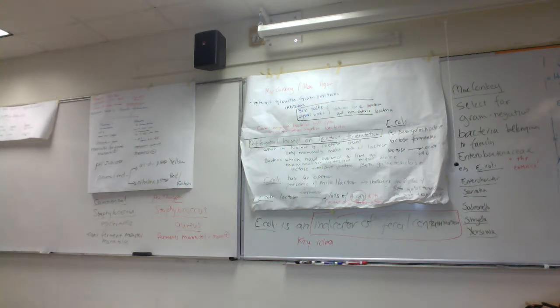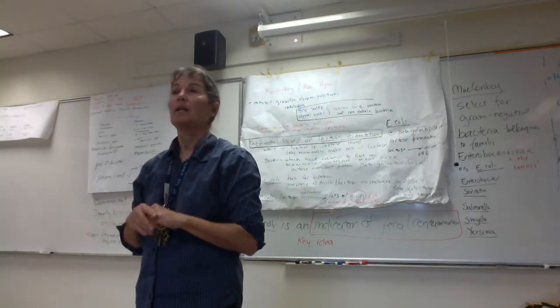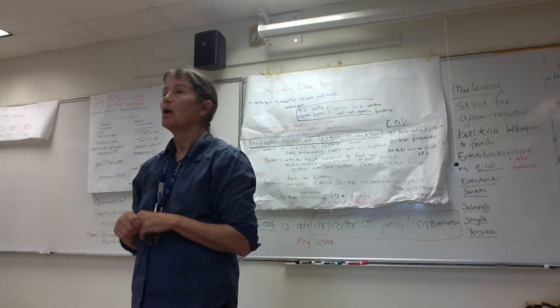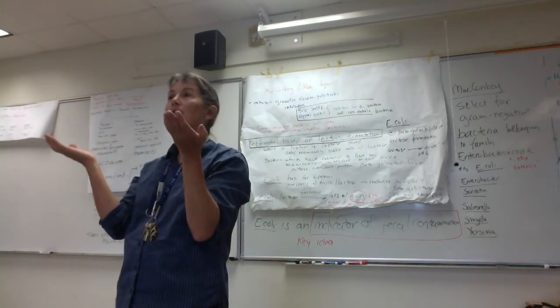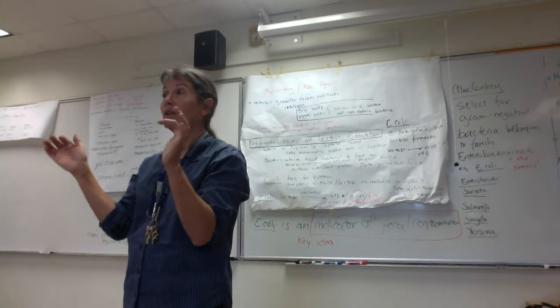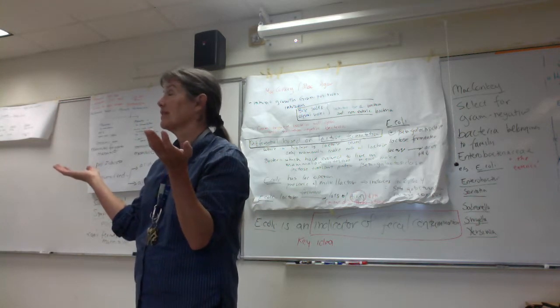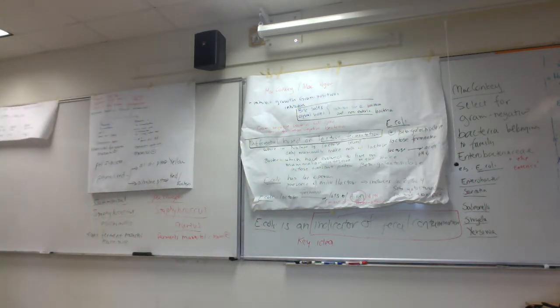So you guys, if we had 10 water samples, say from 10 different wells, and we inoculated MacConkey's media and incubated them, and five of the samples had lots and lots of pink colonies, why do we worry about the water samples that are growing pink colonies? Who could those be? E. coli. So why are we worried? It might mean that those water sources are contaminated with feces. Who cares? Yeah, we should all worry, because who knows what intestinal fecal pathogens are present. Does that make sense, you guys?